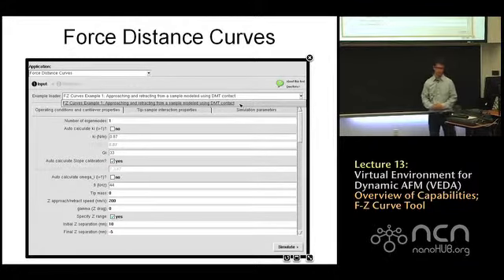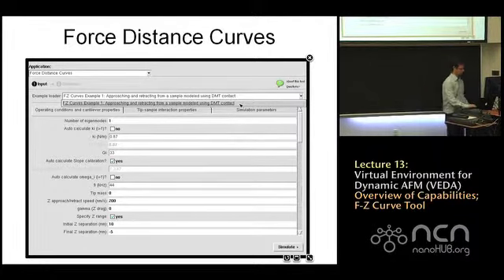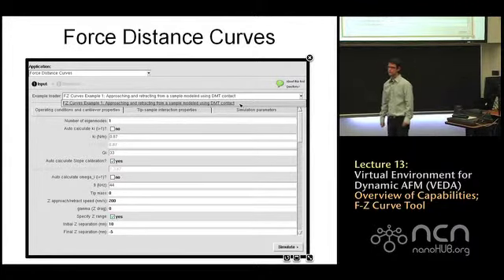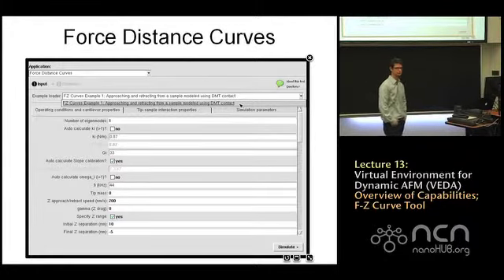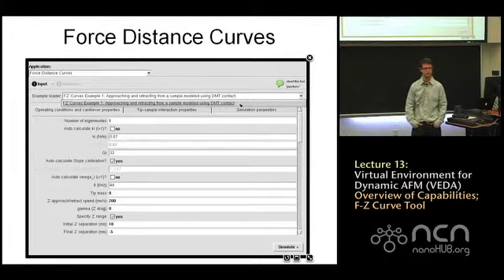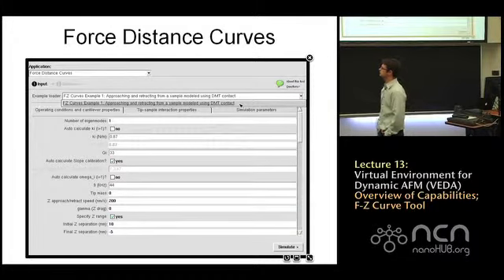Okay, so with that, I'd like to move on to the force distance curves tool. So if we'll go back up to our drop-down menu for the application up at the top left and select the force distance curves tool. I'll go back to input. So yeah, back to, that's the input. Up at the top corner is the application drop-down menu.